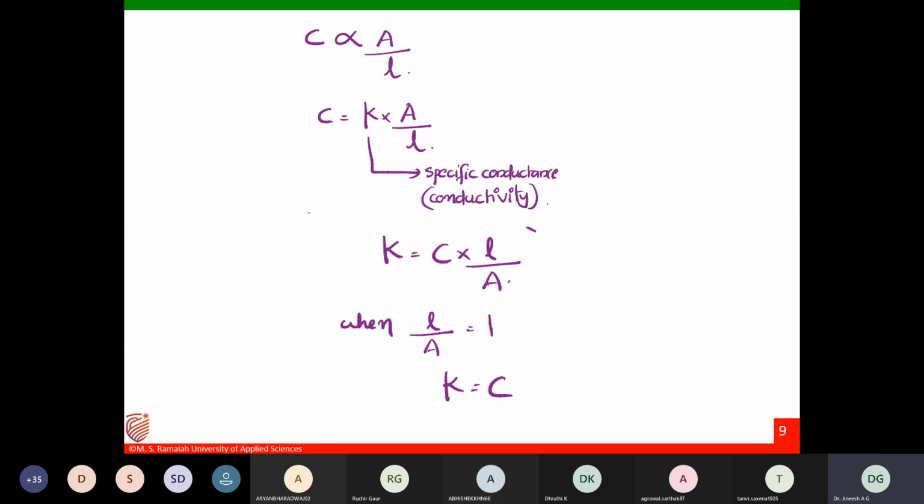For liquids, normally we quantify volume, like liter, milliliter. But here, I'm talking about the length of a solution and the area of a solution. This may be confusing, but no problem. Once I explain the instrumentation of the conductivity cell, at that time you will understand what this L means, what this A means. Okay?